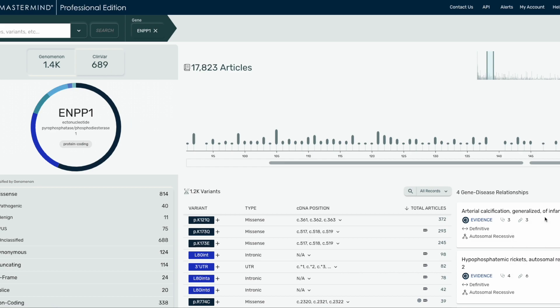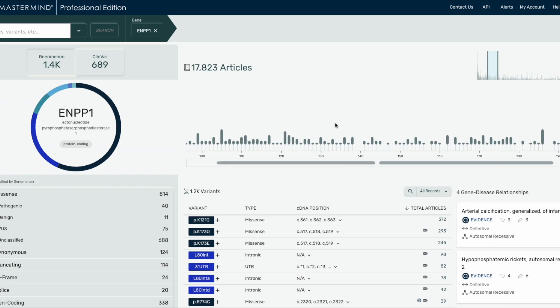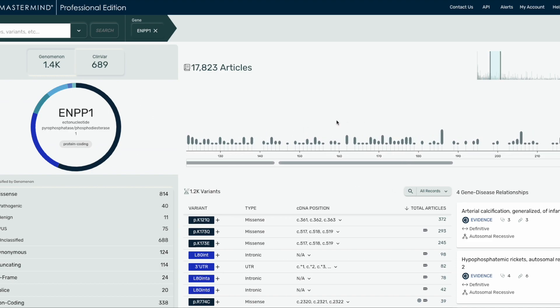Now let's take a look at some of the enhancements to Mastermind features you know and love. These changes are driven by user feedback, so remember to reach out to our team to suggest new features or changes to current features. The variant diagram here allows you to zoom in and out by scrolling, and you can pan across the entire diagram by clicking and dragging.